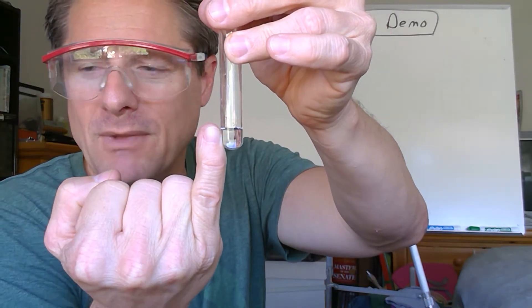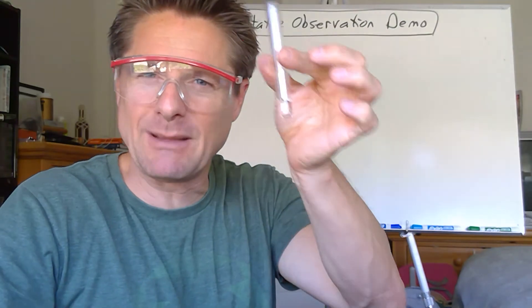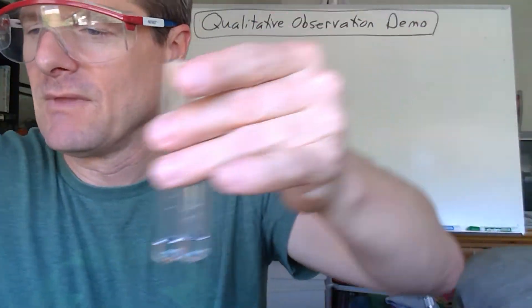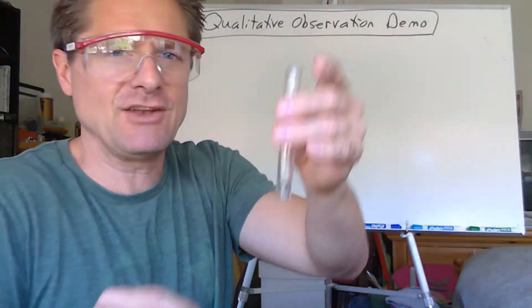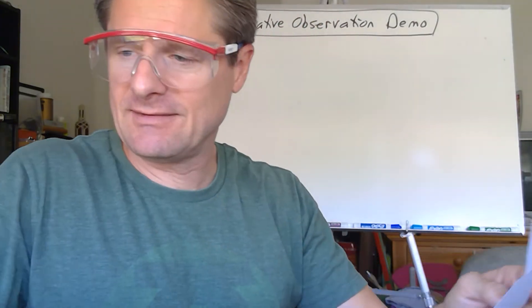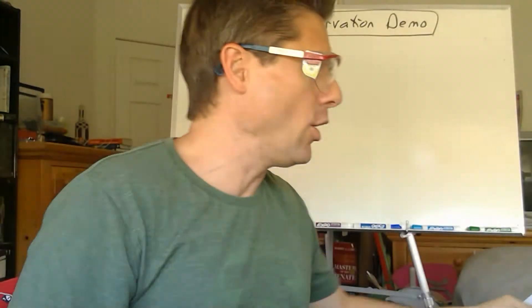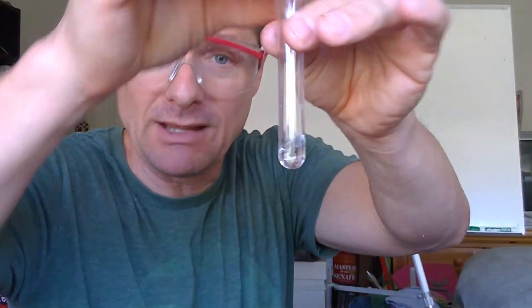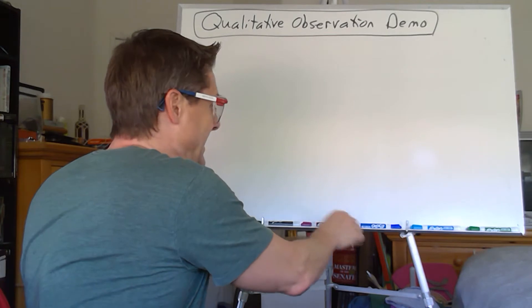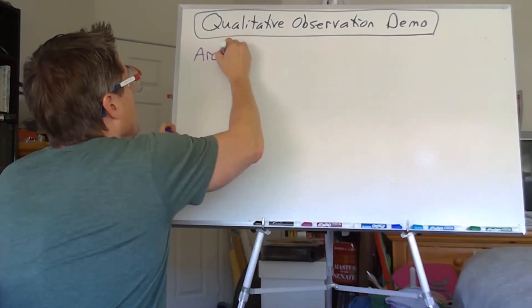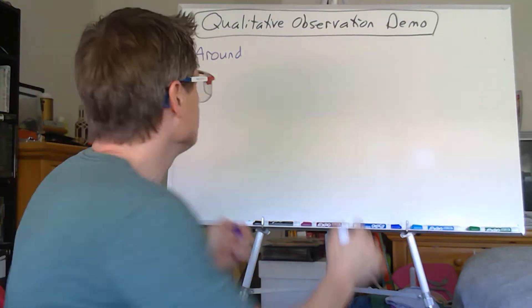This one's a little bit over one milliliter, so I'm going to pour a little out to get these volumes more similar. Those look about the same — approximately one milliliter each. Let's describe the first one: the lead(II) nitrate. For solutions the order is amount, clarity, color, odor, temperature, concentration, identity. So this is approximately one milliliter — write that out: 'around' or 'approximately' one milliliter.